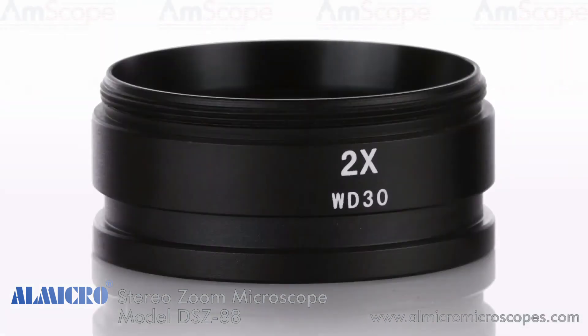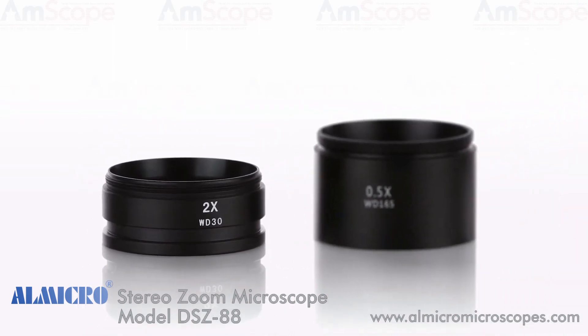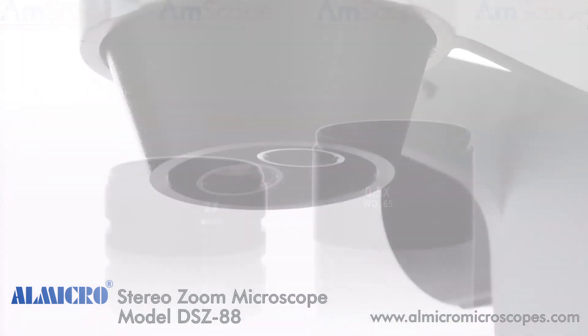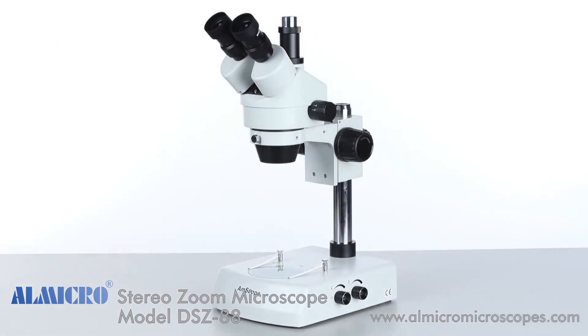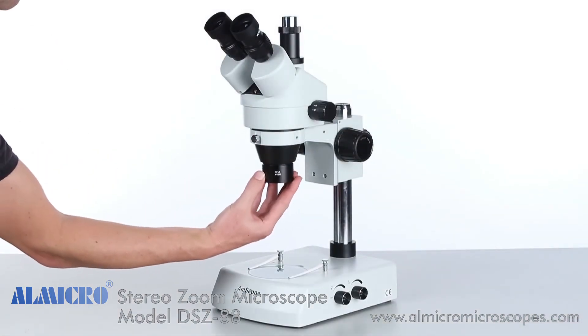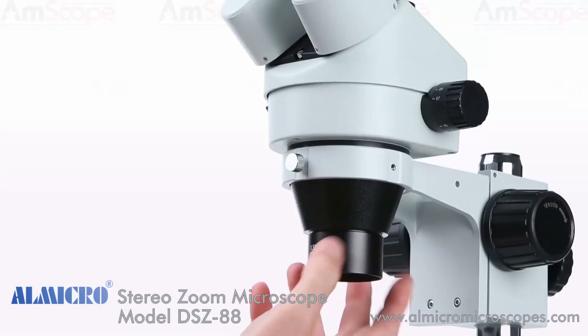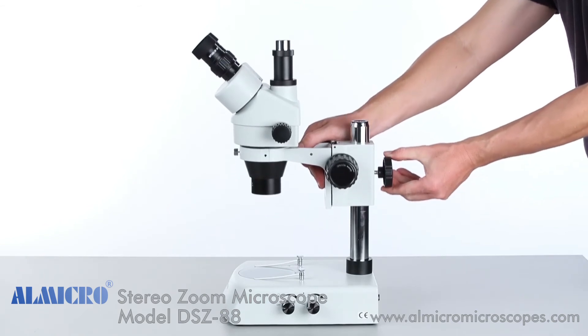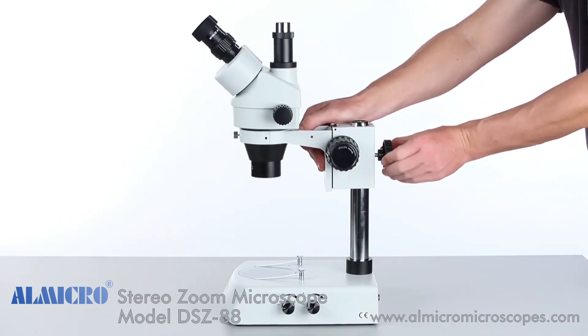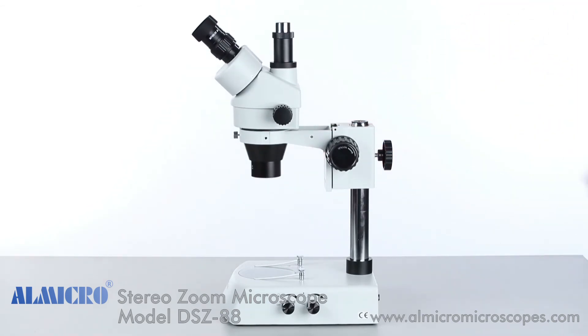The SM2 series head accepts a range of accessories, and among the most popular are Barlow lenses — auxiliary lenses that either increase or decrease the magnification by a set factor. Simple to install, they attach to the head's threaded lens port. The 0.5x Barlow lens will decrease the magnification by one half. The decreased magnification will require a larger working distance, so the focusing rack must be raised.